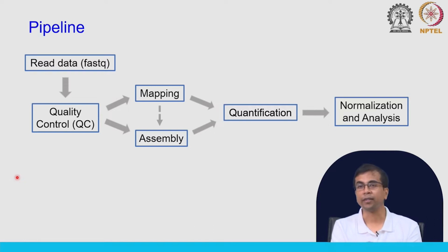Okay. So, some of these biases can be addressed computationally using different techniques. There are different types of normalization methods, and each method has its own advantages and drawbacks. We will talk about that, and we will utilize some of these normalization methods for our own analysis.